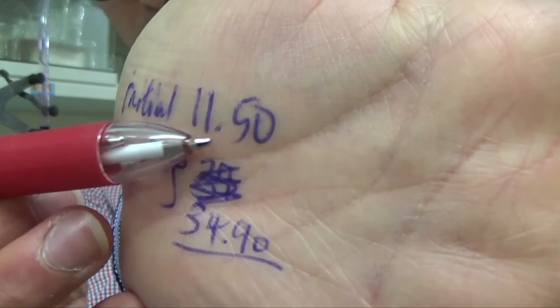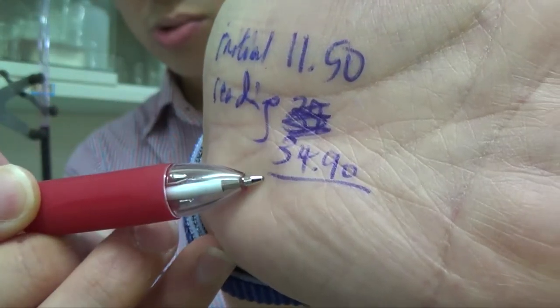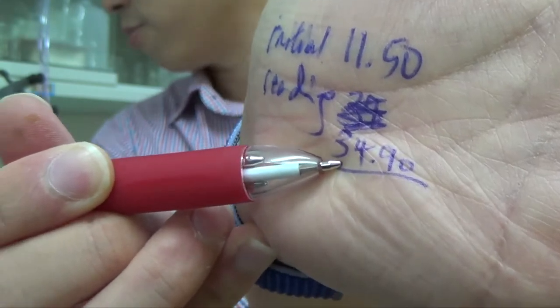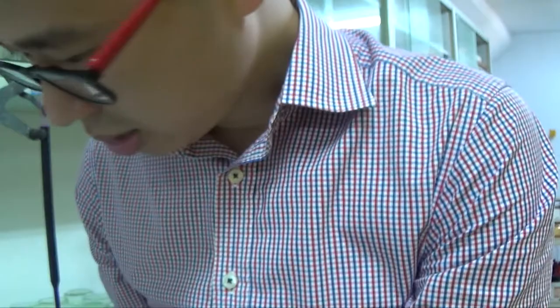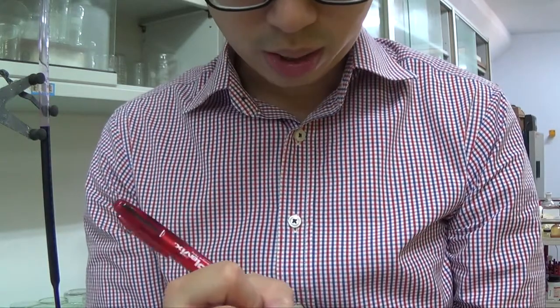Again, I don't want to spoil my paper, so I'm just writing on this, but you know. So 2 decimal places, 11.50 was what I started with. Final volume, 34.90. So your volume of Q used from the burette will be 34.90 minus 11.50. That is 23.40.